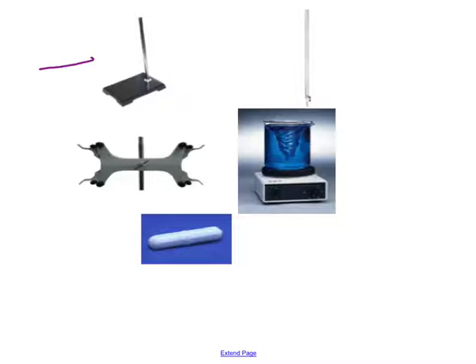You're going to have a ring stand. And on that ring stand, you see right here is a ring stand, you're going to have a burette holder. The burette holder is made to hold a burette. To actually get the burette in there, you're going to squeeze these 2 little clamps down, and it's going to open and make a little space for you to insert the burette. It's kind of going to be set up for you, but you will have to be able to remove the burette, take it down, and put it back up as you fill it. So that's definitely something you're going to get to play with. And you get to use, and everybody is so excited about using these in AP Chemistry, magnetic stirrers.